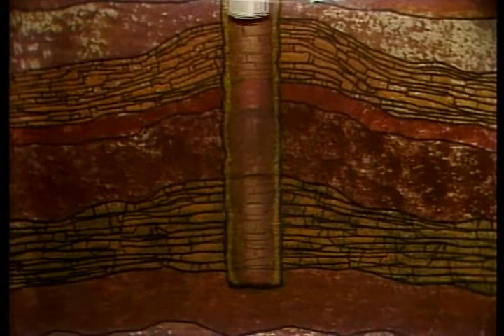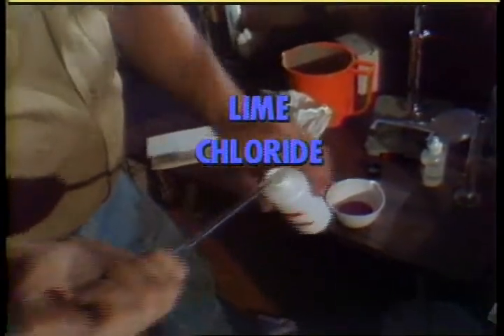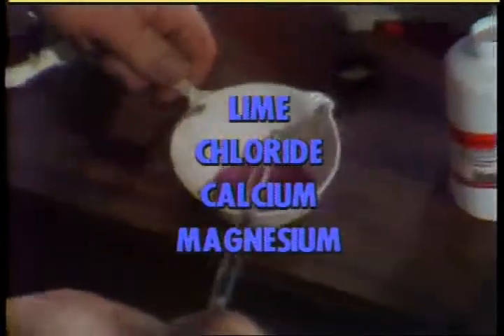After all, the filter cake is sort of a temporary liner until steel liner can be run. You certainly don't want it leaking or soft and mushy. The filtrate and mud are tested for their content of lime, chloride, calcium, magnesium, and other things. We use .02 normal sulfuric acid and titrate the red color back to its original state.